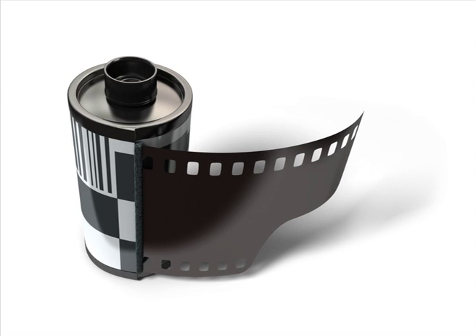From this project, we were able to learn more about enzymatic function, the chemistry of photography, and how to more effectively set up a lab procedure and apparatus that would be appropriate for different situations. From the results, it is clear that the higher the trypsin enzyme concentration is, the more clear the film will be, because more enzymes are available to break down the gelatin that contains the silver halides that are integral to the development process.